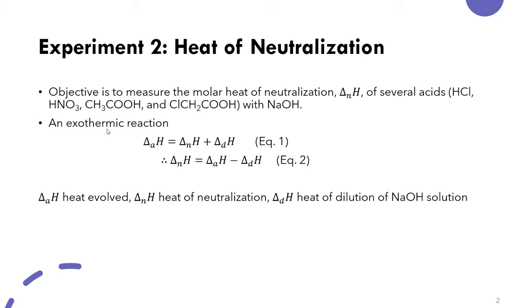Now this is an exothermic reaction, and what you get is the combination of heat of neutralization and also heat of dilution from the dilution of NaOH. Because we are interested in the molar heat of neutralization, you just have to tweak the equation.